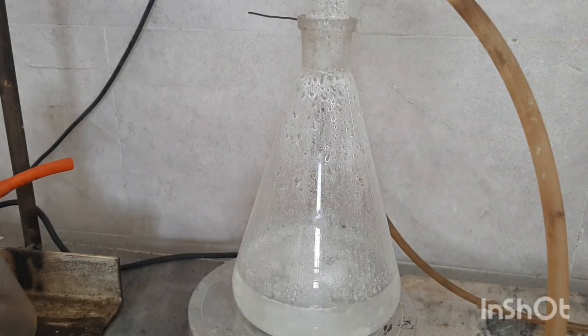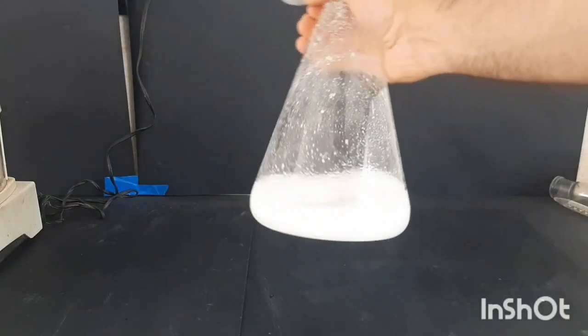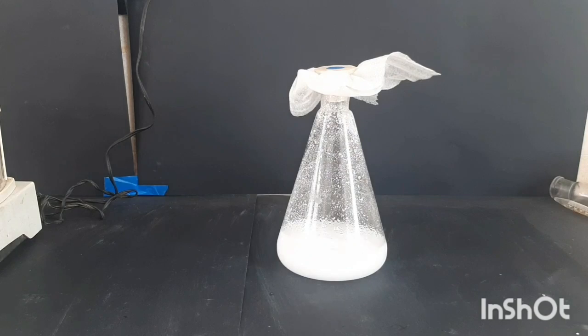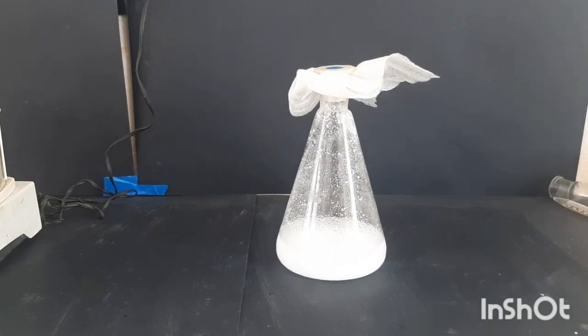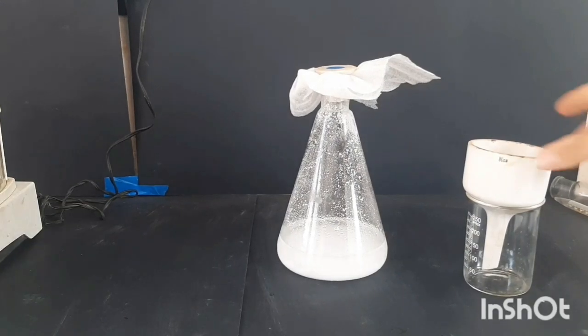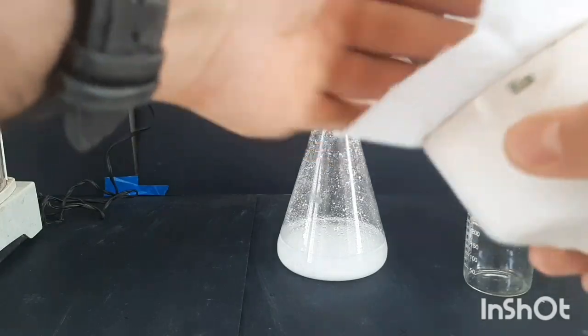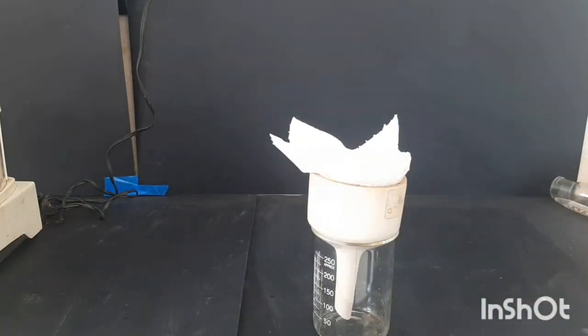As you can see, the mixture has cleared up and the cyclohexanol is no longer present to form a layer, and the adipic acid is dissolved in the boiling water. I let it cool to room temperature and then put it in the freezer for an hour to get all the adipic acid that has dissolved in the water to precipitate out. So I'm going to filter the adipic acid using a paper towel because I had a stupid idea and wanted to test it.